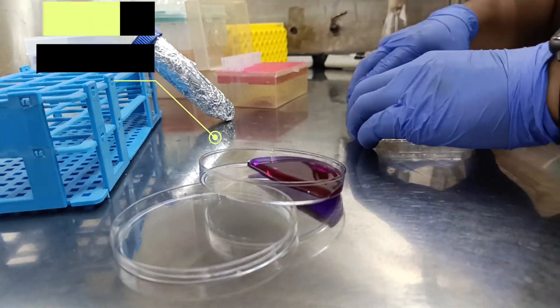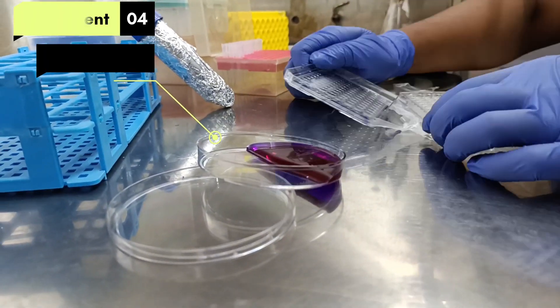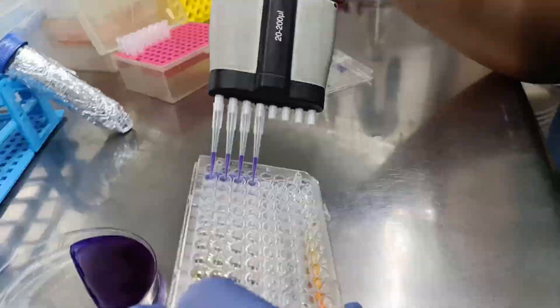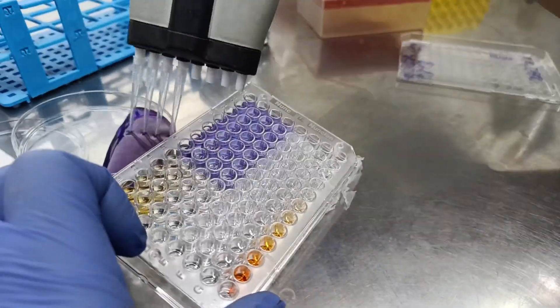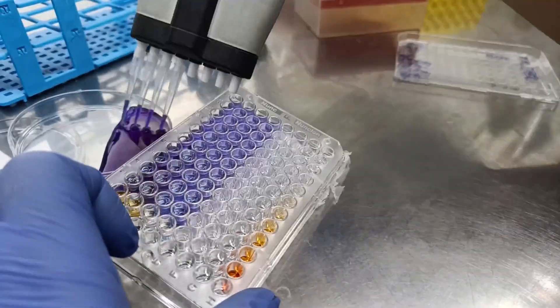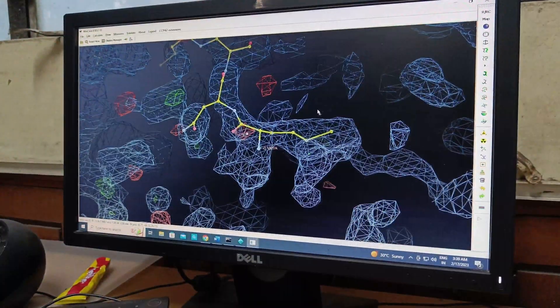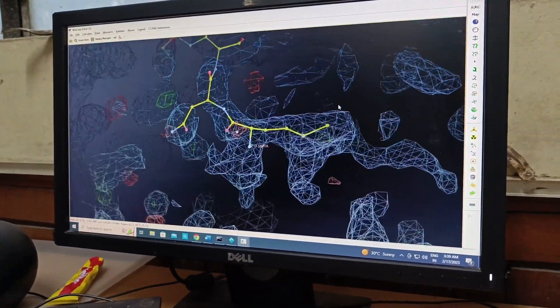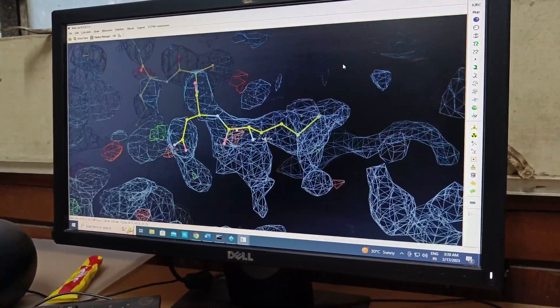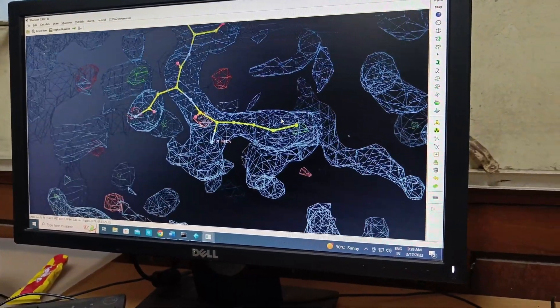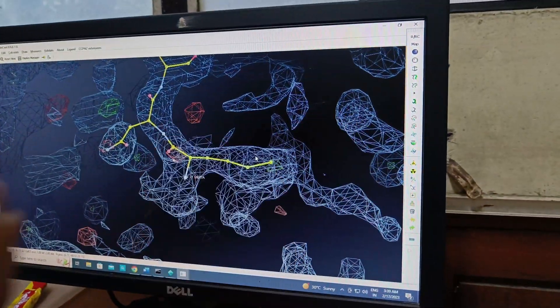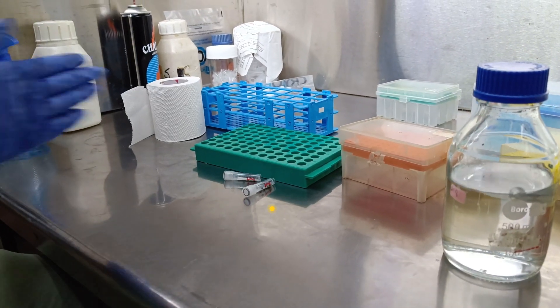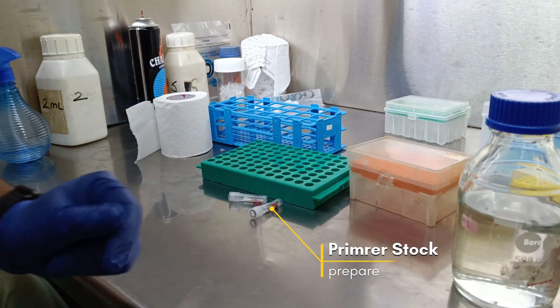Now I am adding resazurin dye to a MIC plate which has been in the incubator for the last few days. With the color changes we will be able to know at which minimum concentration the bacteria cannot grow. I suddenly noticed that the resazurin was forming some crystal structures.